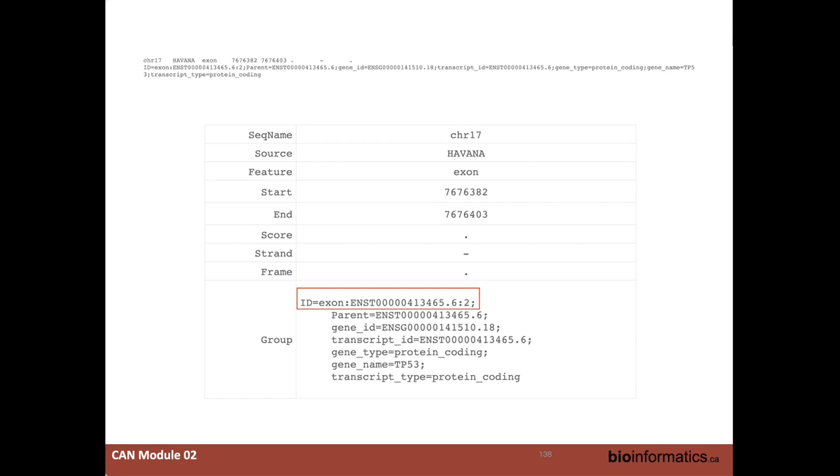Excellent. So it's actually going to give you some transcript information about the source. It's going to give you a parent transcript if there is a parent to it. It's also going to give you the transcript ID and this particular gene ID, and these are from Ensembl. Not many people really like this kind of gene naming convention, but you can always go back and forth just by going onto Ensembl's database and looking at that. You can get the exact transcript ID for this one, get some more information.